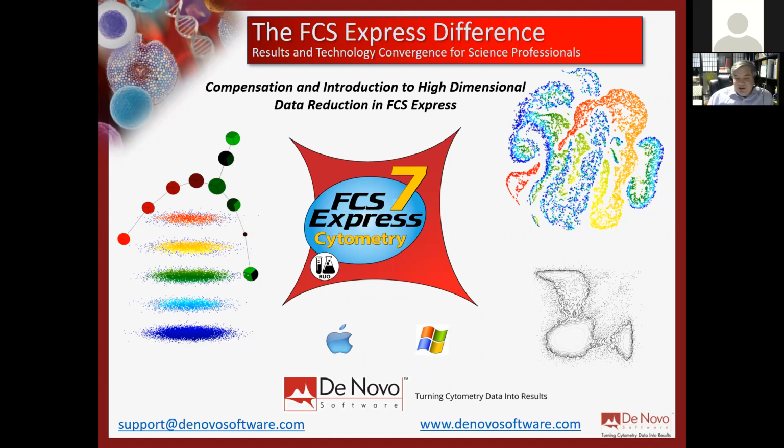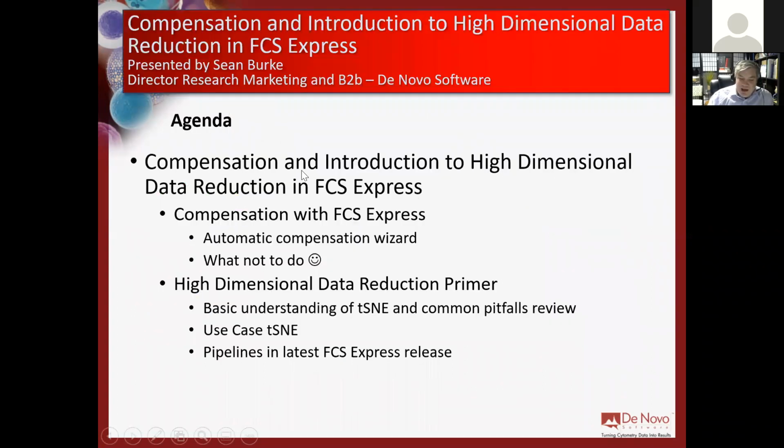And I also think, if folks are getting into some of the post-acquisition compensation in FCS Express, generally it's because they're working with higher dimensional or higher parameter based data sets. So I thought it'd be a good intersection between the two topics. As for a little agenda for today, we're going to get started by looking at compensation with FCS Express. Essentially, what we're going to run through today is how to use the automatic compensation wizard in FCS Express.